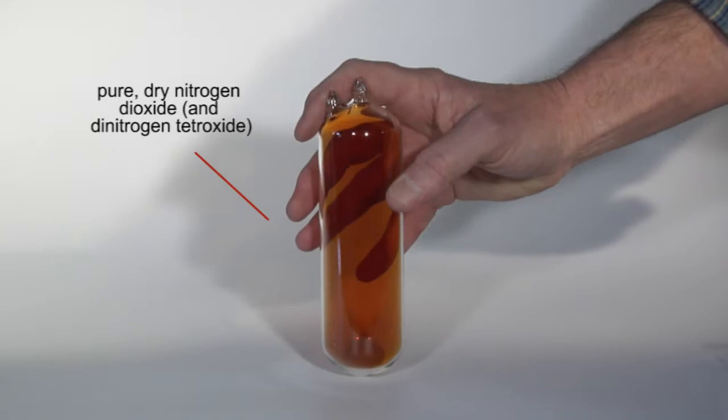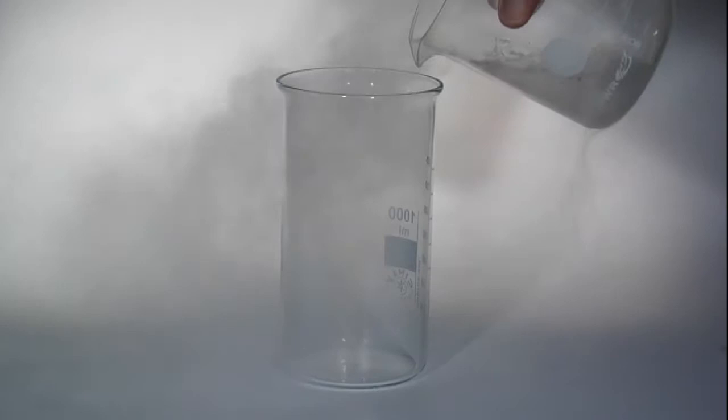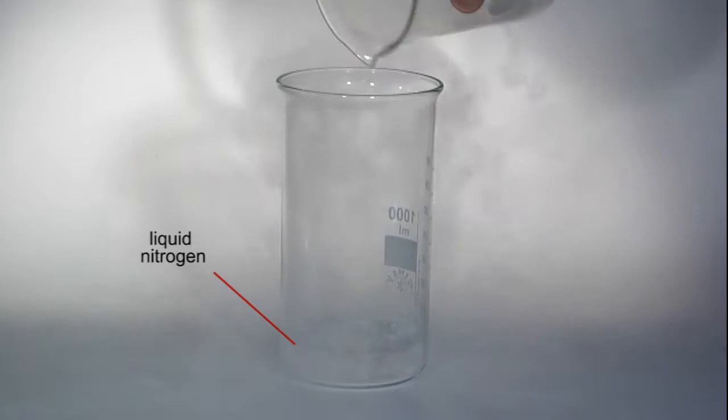Nitrogen dioxide is brown and produces the color of the mixture of the two gases which are present in this equilibrium. Liquid nitrogen is used to cool the mixture down to temperatures approaching minus 200 degrees Celsius.